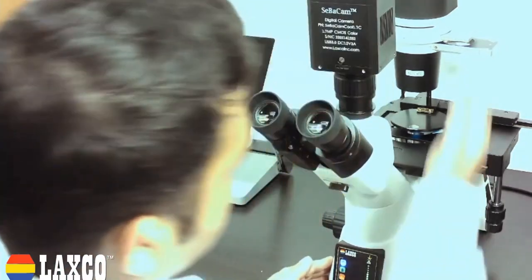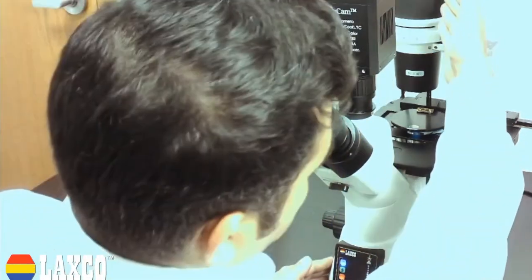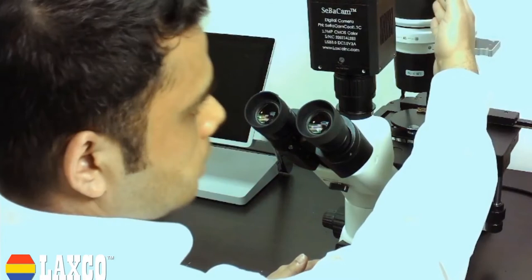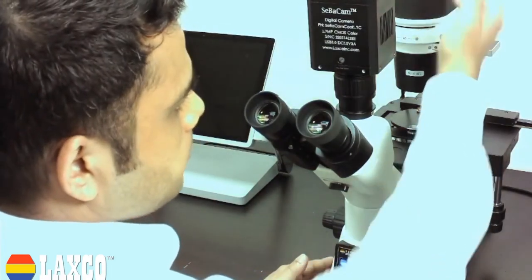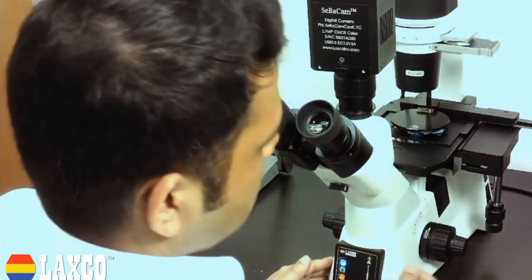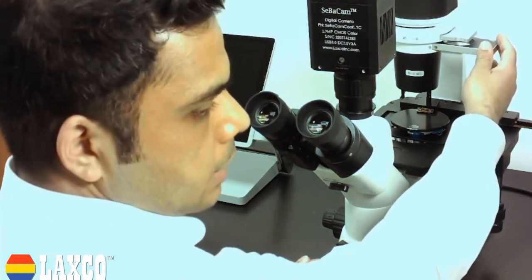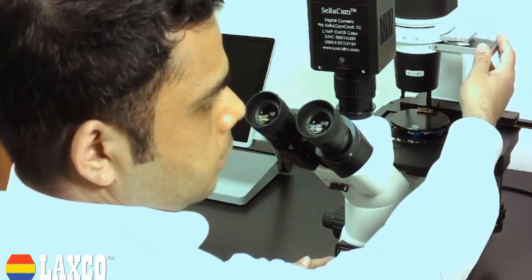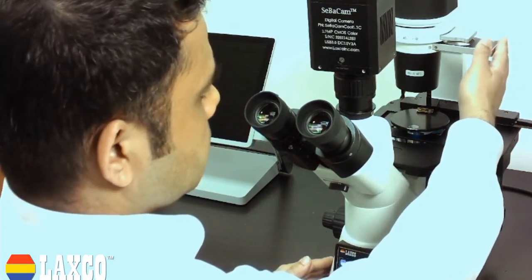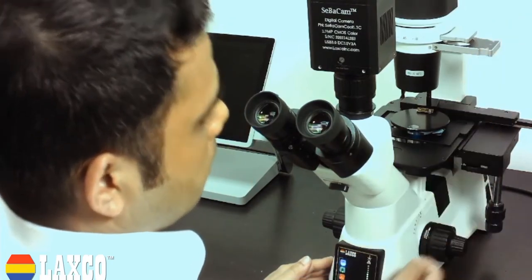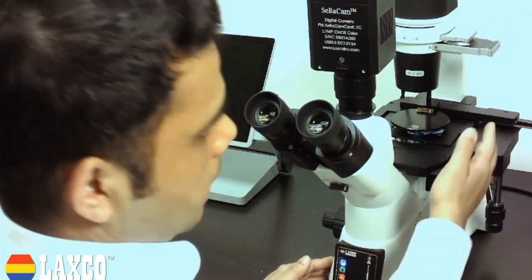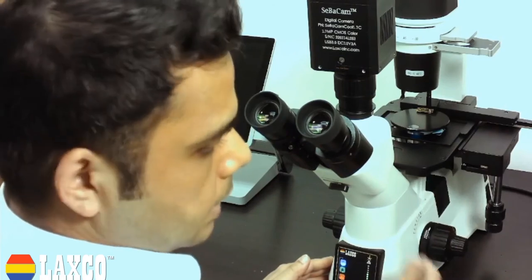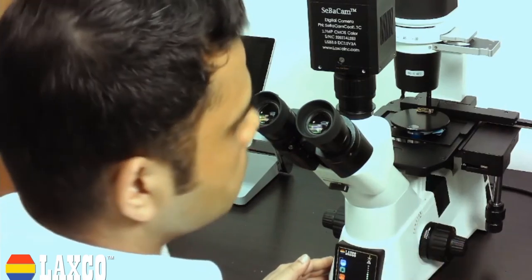You have the illumination source for your phase and bright field applications up here. I have also attached a phase slider here for your phase contrast applications. There is also a mechanical stage added here for easier sample movement.